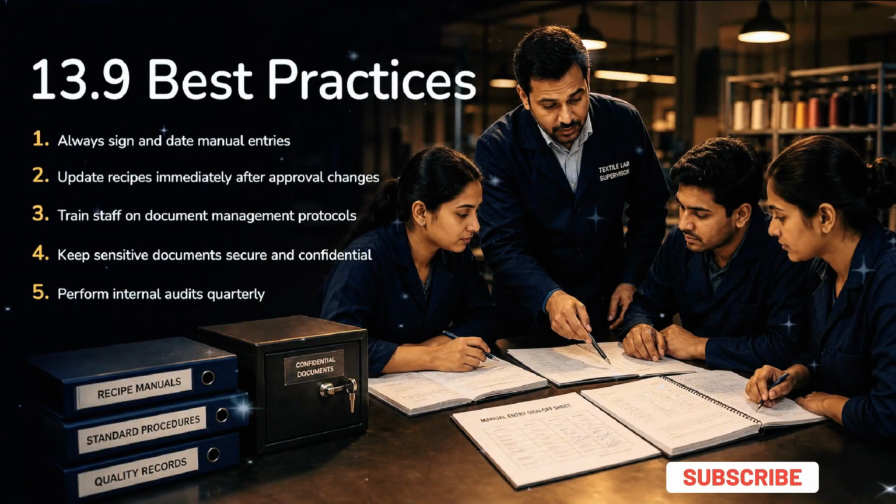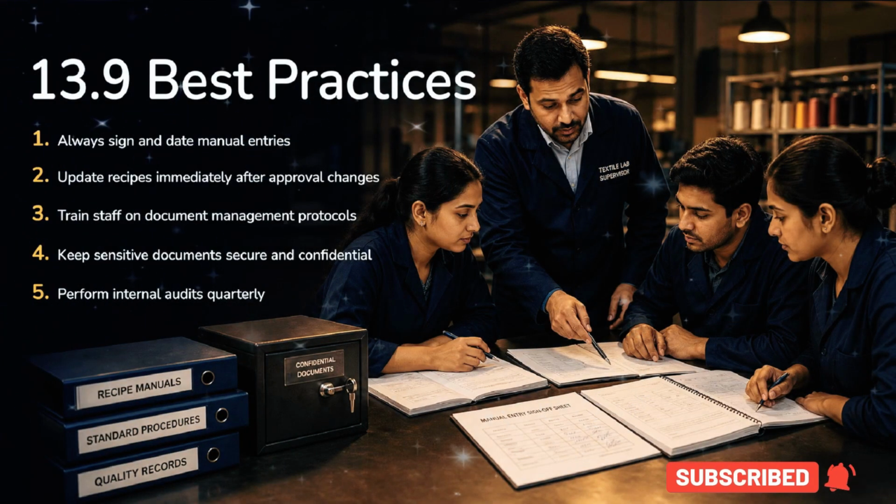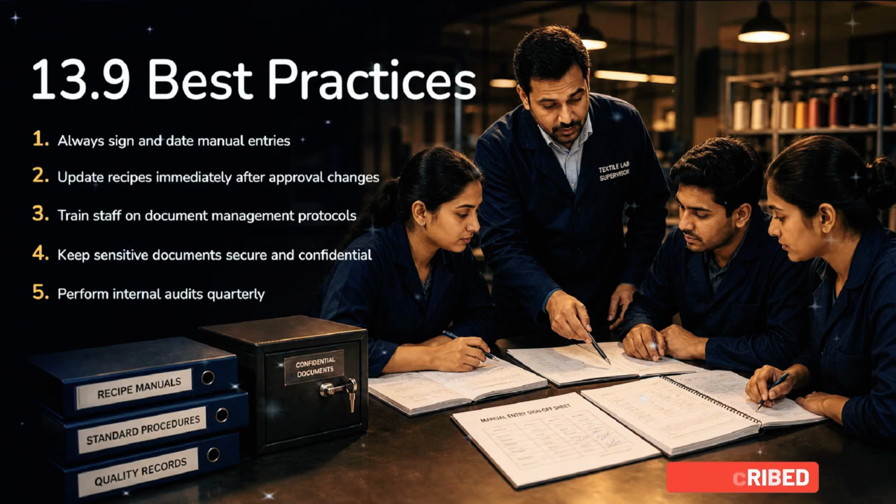Follow these best practices. Always sign and date manual entries, update recipes immediately after changes, and conduct regular staff training. Ensure sensitive documents are kept secure and perform internal audits quarterly to maintain high standards.